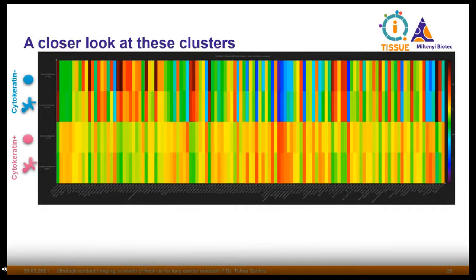I decided to plot all the markers I had in this run in a heat map to have a better overview and then have the possibility to go further into it. But here I will just stay here. This is a strategy for you to imagine how to handle this kind of data.